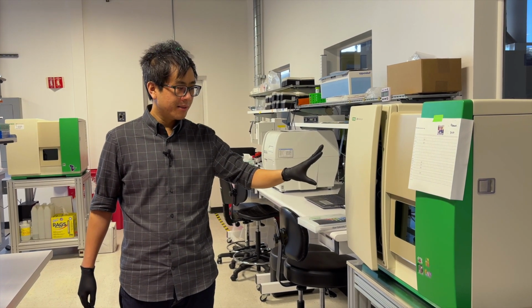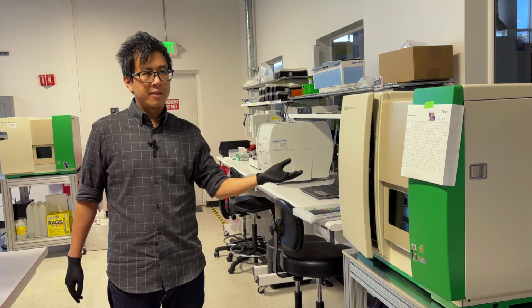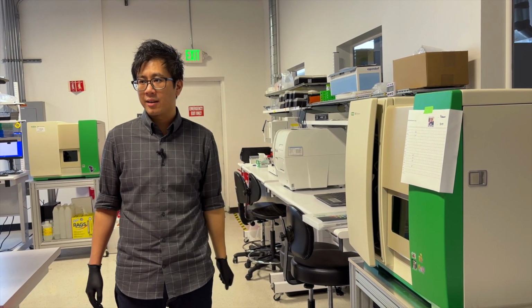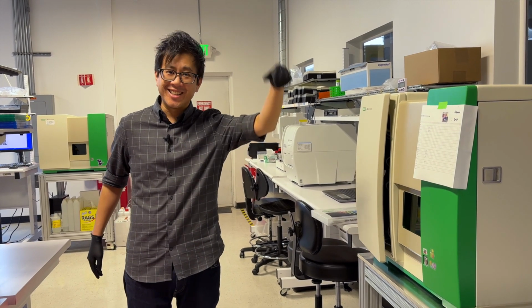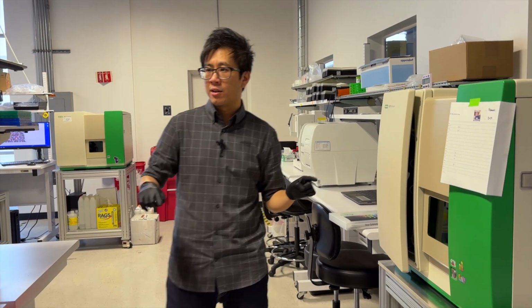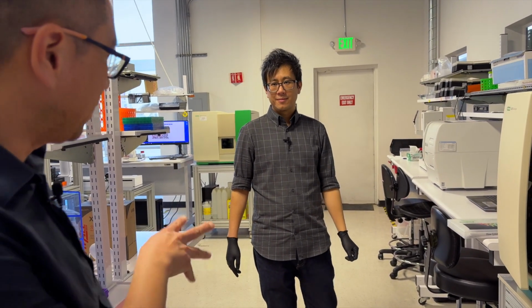And again, what you don't see here is all the software behind it. If you are reading a lot of different targets, you have a large panel and you're getting a lot of stuff out of every single cell, out of every well in your 384 well plate, it's a lot of data. And the act of even getting that data off of this computer and into the cloud in a way that we can analyze it becomes really important. So all of these little instruments that we have that are kind of isolated on their own still have a layer that makes it really easy to extract all the data that comes out of them, put it into our cloud, and start analyzing it. Into your own custom-built software suite you call Vector, is that right?